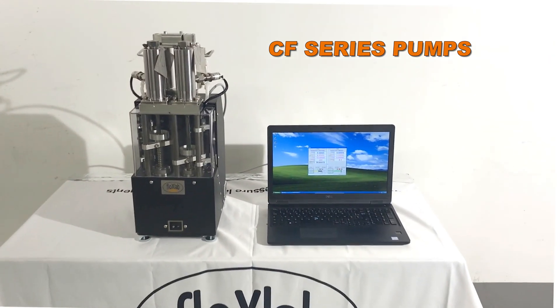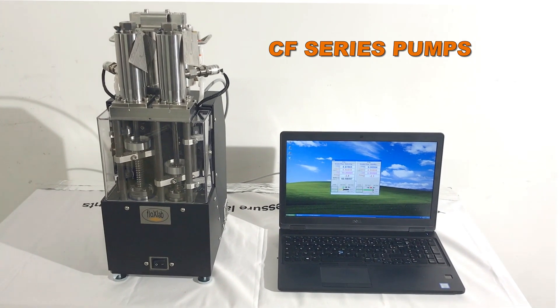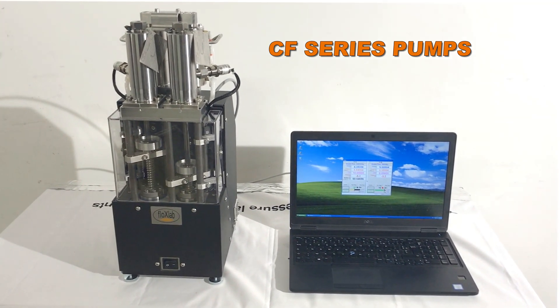FluxLab CF series pumps deliver unlimited pulseless flow at all rates and pressures with unparalleled accuracy and repeatability.